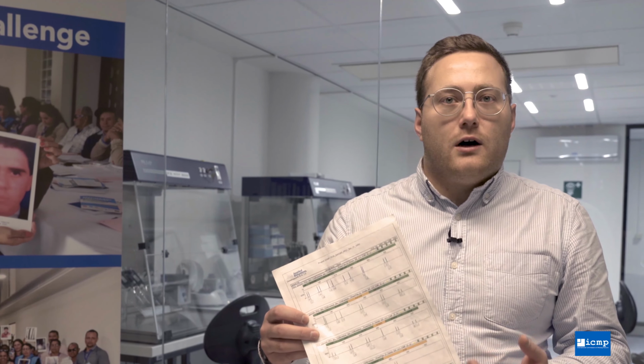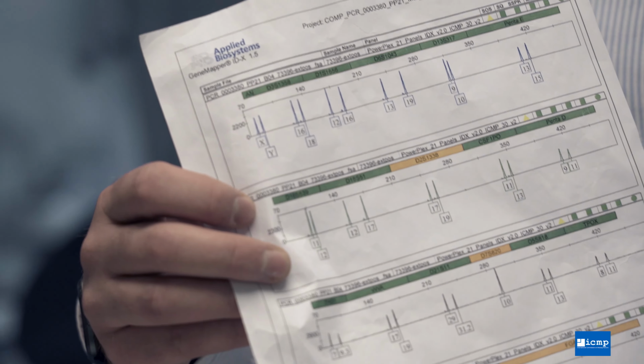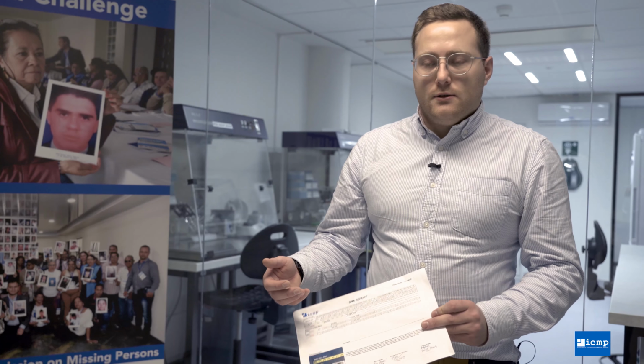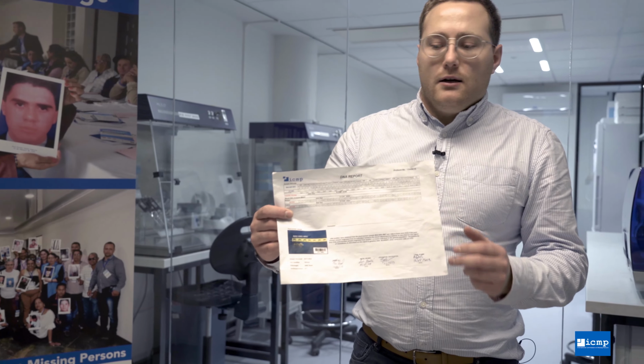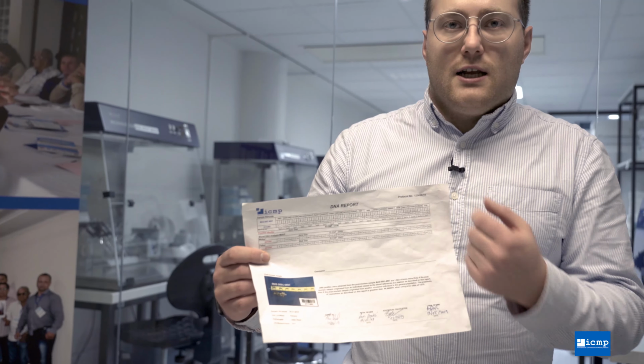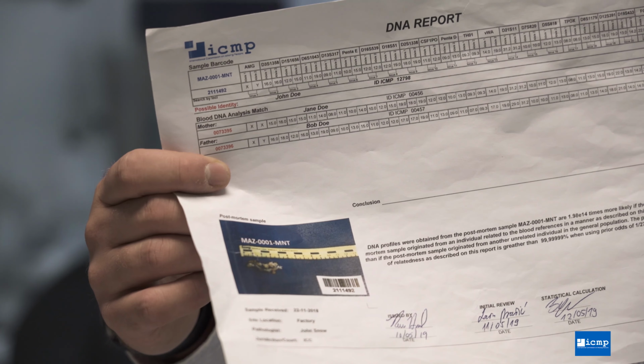Following the completion of sample processing, we must then analyze the data that's obtained. This is what the DNA profiles that we obtain look like, where you can see that you have two peaks represented at each region, one from your mother and one from your father. Following DNA profile analysis, we then perform DNA matching on a database level. If a DNA match is obtained, a DNA match report is produced. This report looks like this, demonstrating both the original sample as we documented it when we received it, and also the genetic data that were the results obtained for this sample.